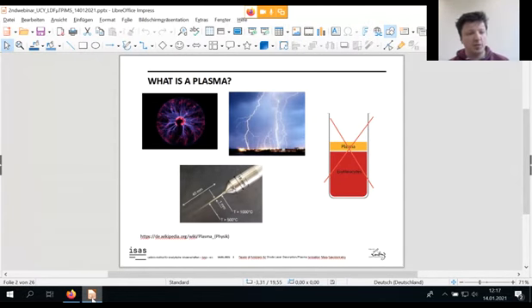First of all, let's talk a bit about plasmas. The bottom message of this slide is basically that we're not using blood plasma from the centrifugation of blood, but rather a low temperature plasma, which you have seen in the previous presentation from time to time simply as low temperature plasmas, LTPs, or DBDIs, dielectric barrier discharges.